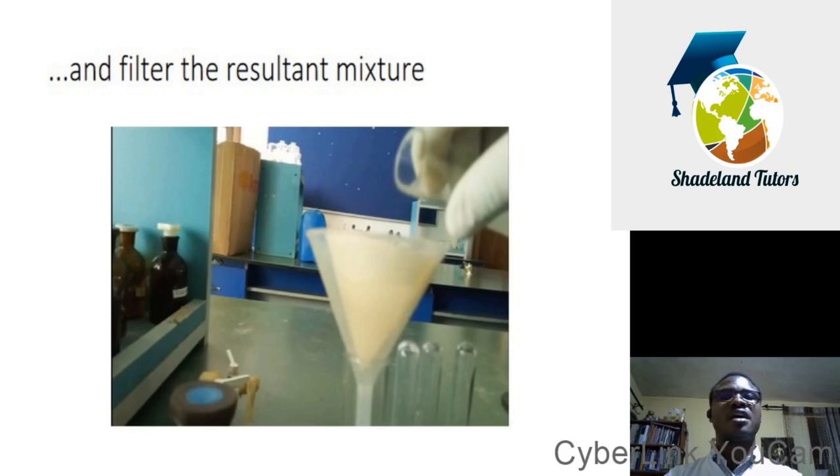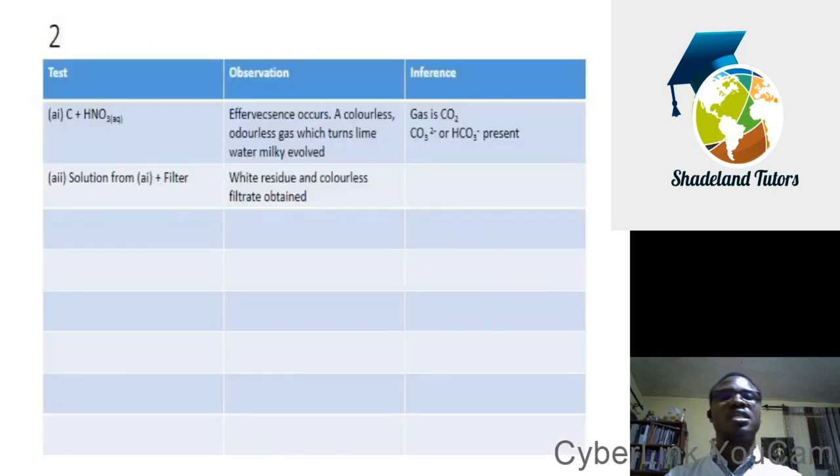Then after the filtration, it's very important that you report. Every time you filter, you report the color of the residue and the color of the solution obtained. In this case, white residue is obtained, colorless filtrate is also obtained. It's very, very important that you report this.